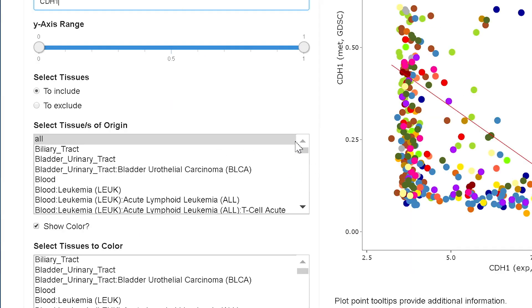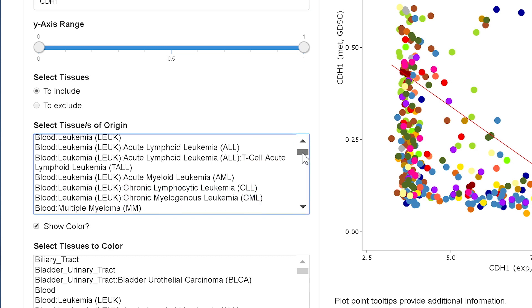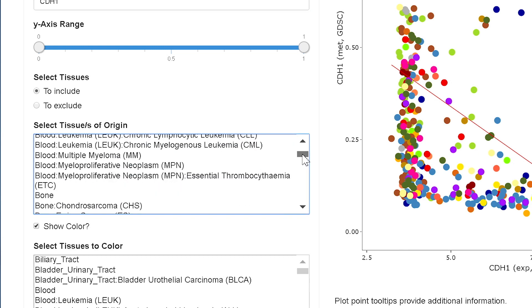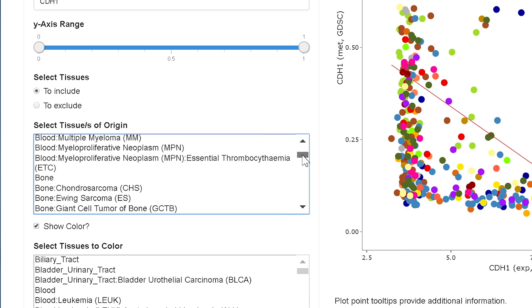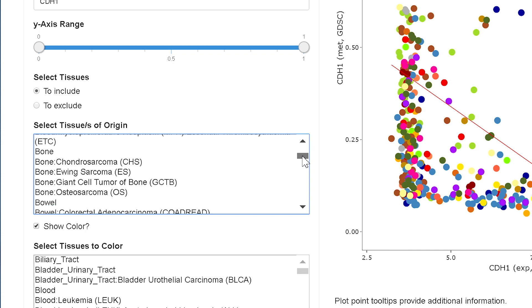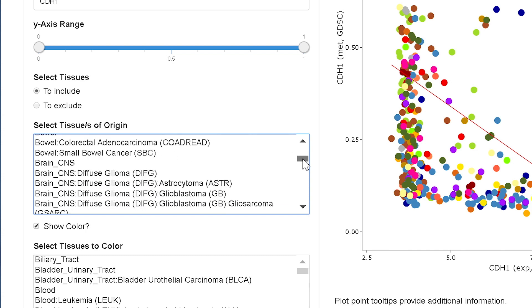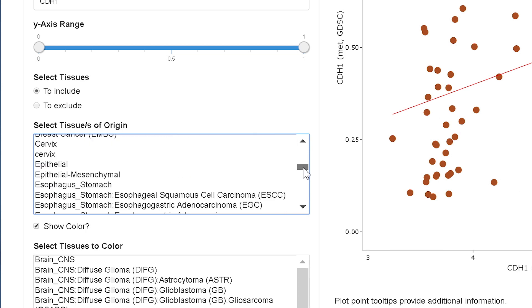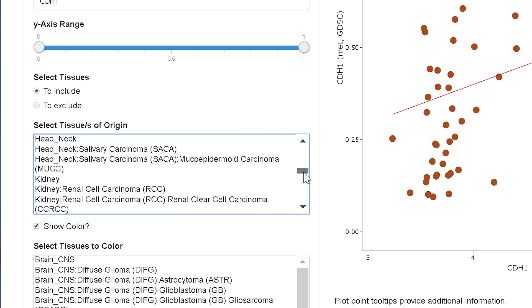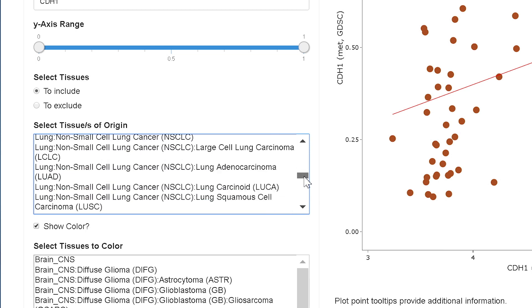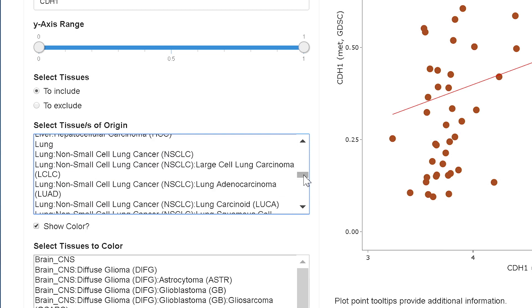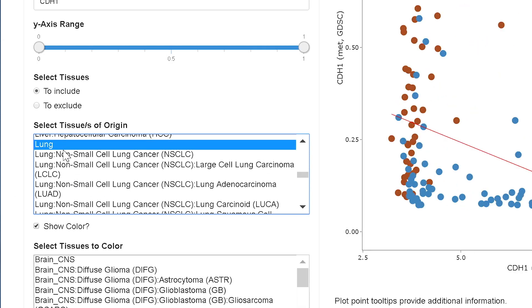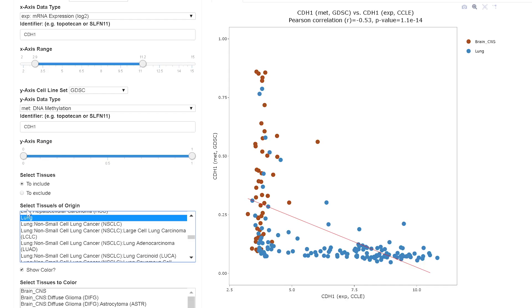Something else you can do here is choose which tissue of origins you would like to include. So I'm going to choose brain. And then add on lung. I'm holding down control on a PC, on a Mac you would use command.